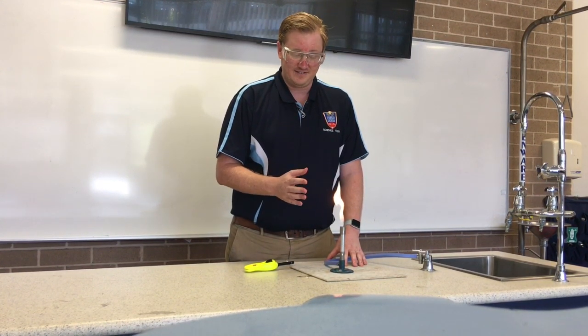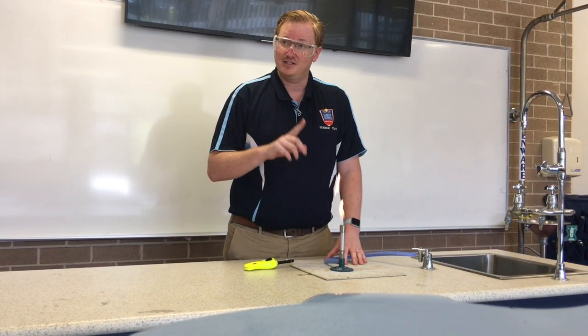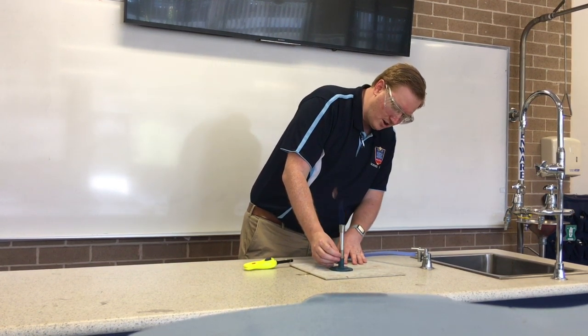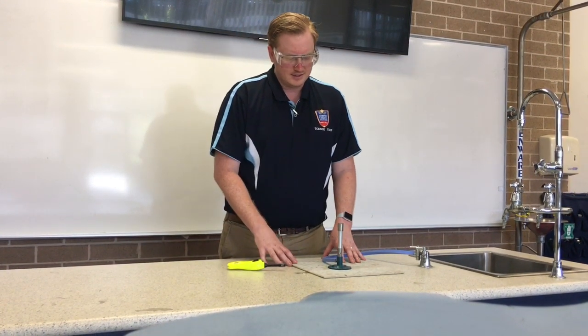This is the safety flame because it's nice and easy to see and it's cool relatively to the hotter flame. To get to the hotter flame, you turn the collar so the holes are open — you'll hear that sound — and you'll have a blue flame that's a lot less bright.